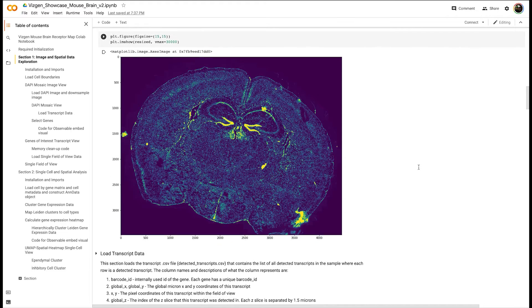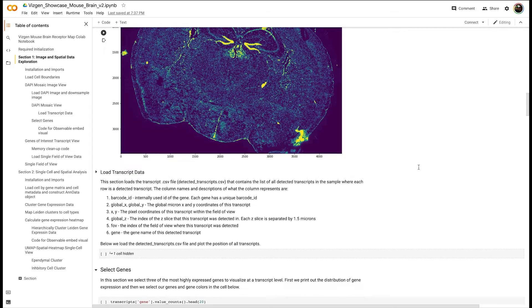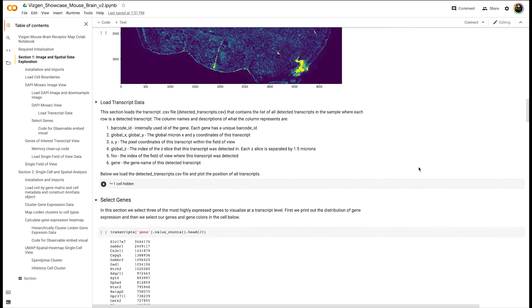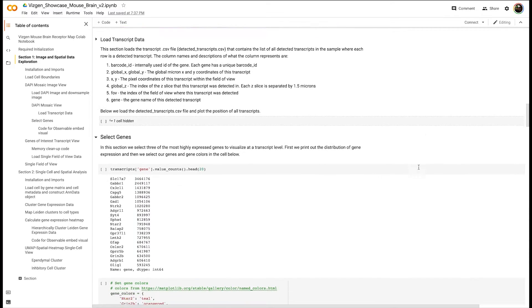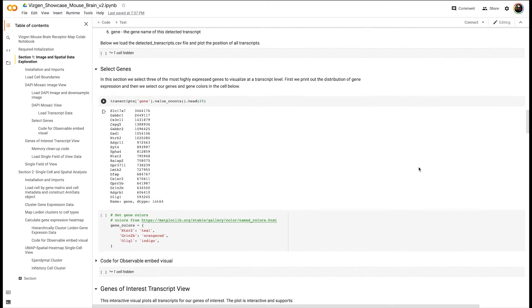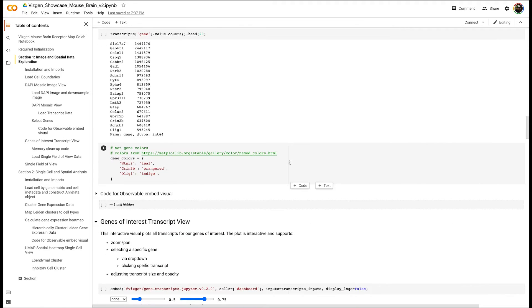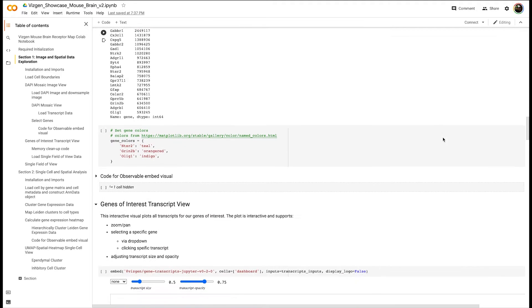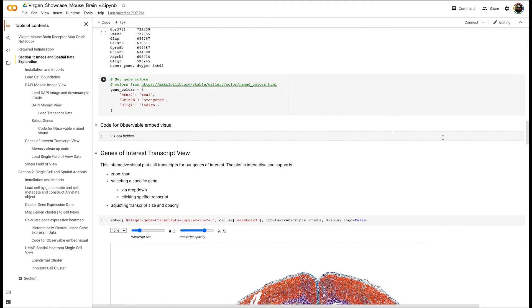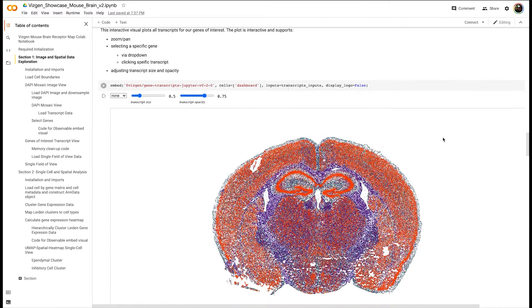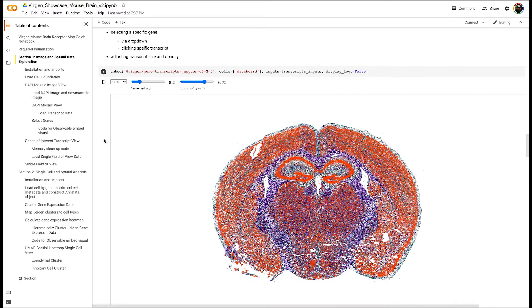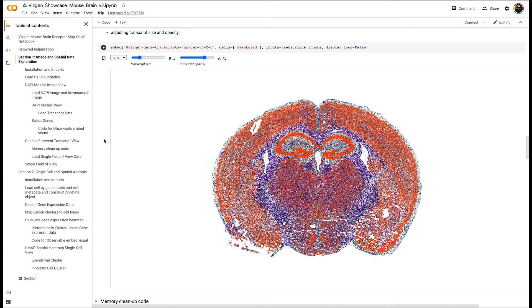Next we load transcriptomic data and we select a subset of genes of interest based on the most highly expressing genes. Here we select three genes and we interactively visualize their location within the entire tissue using an interactive visual we built using DECGL and ObservableHQ.